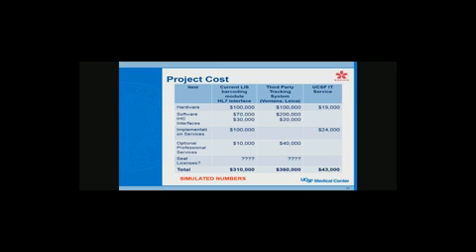But just looking at this, obviously it's a huge cost. Hardware alone is $100,000. Just barcode scanners, those handheld scanners that you use, we spent over $30,000 just on those because we have over 100 seats that use them. We have our histology lab, the smallest part of it. We have maybe 20 scanners in there, but we have 60 pathologists, 25 residents.